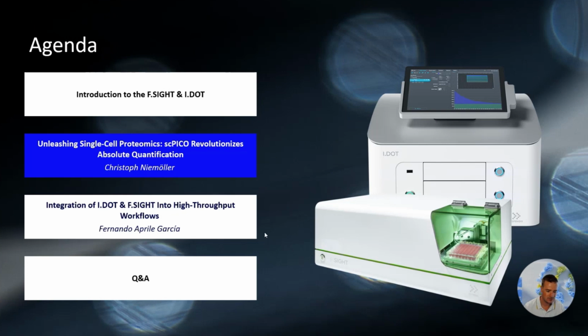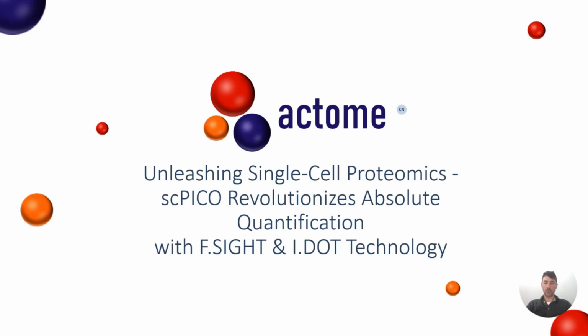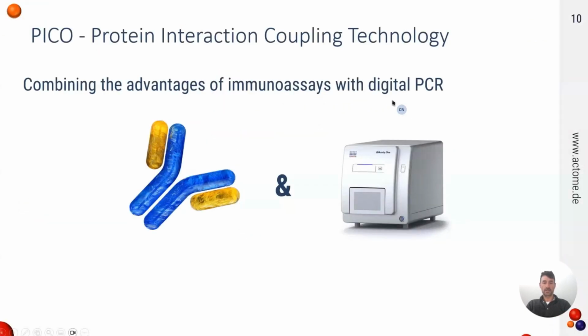Thank you so much, Holger, for the kind introduction. I'm really happy to be here today to give this webinar about our protein interaction coupling technology, short PICO, and our recent development of a proof of concept workflow, which we have developed to apply PICO in order to precisely measure proteins within single cells, also using the F.SIGHT and I.DOT technologies.